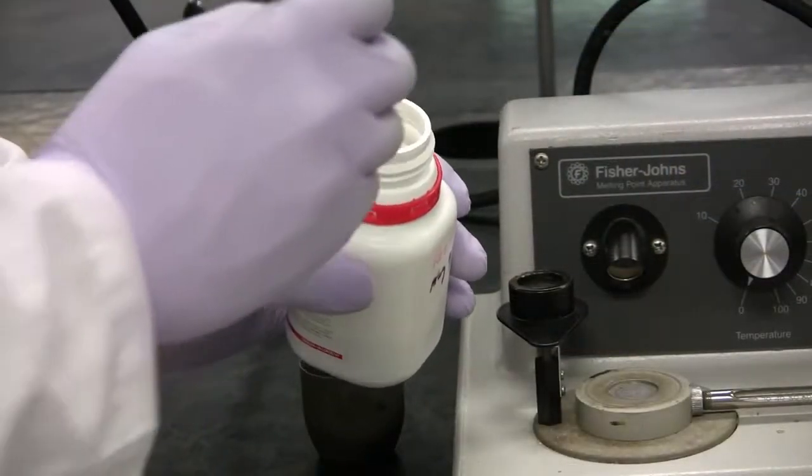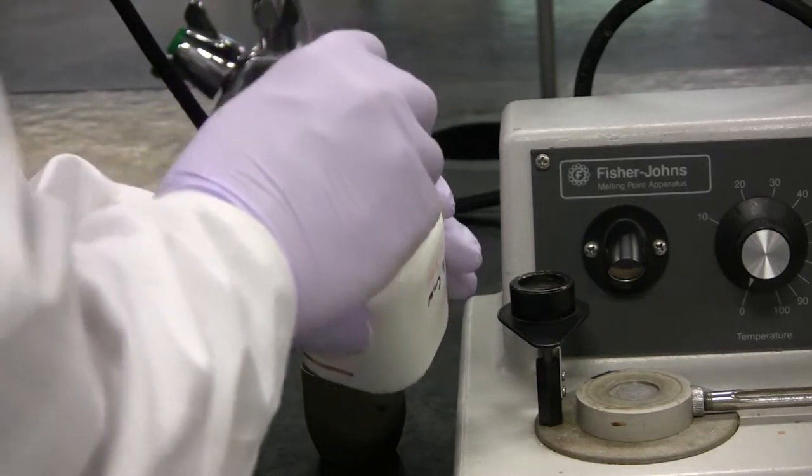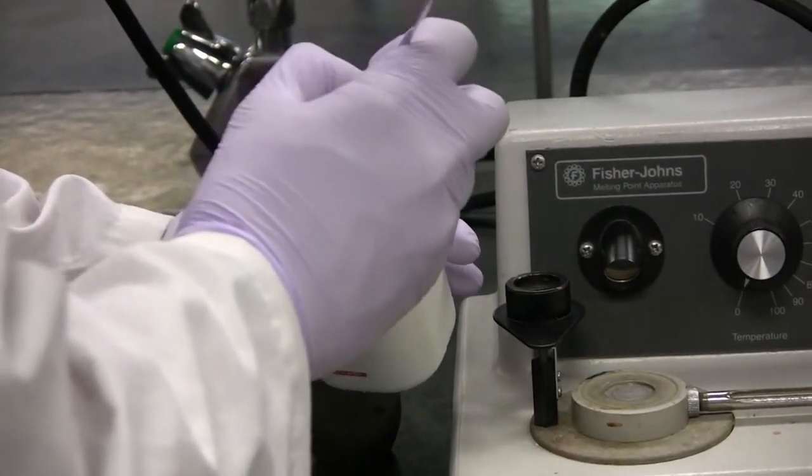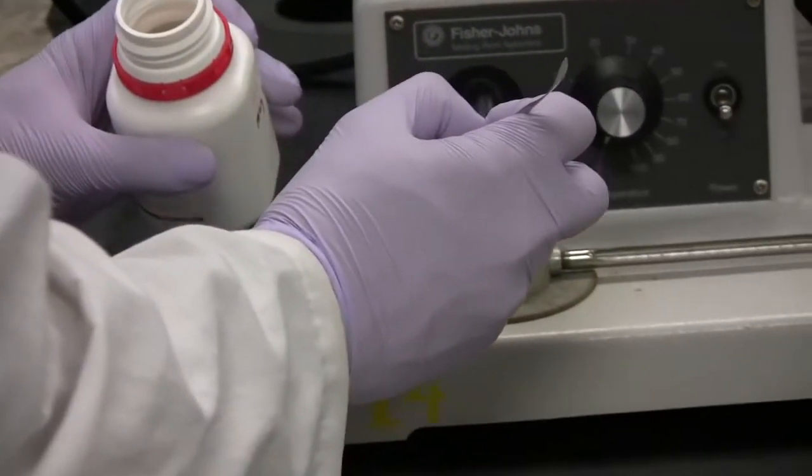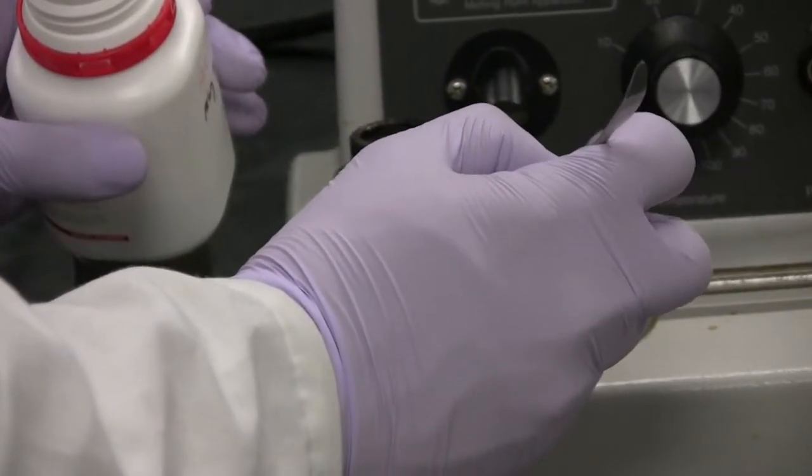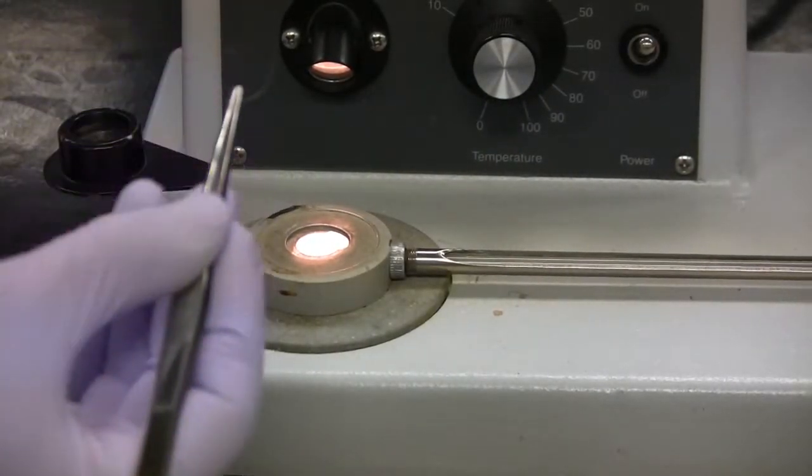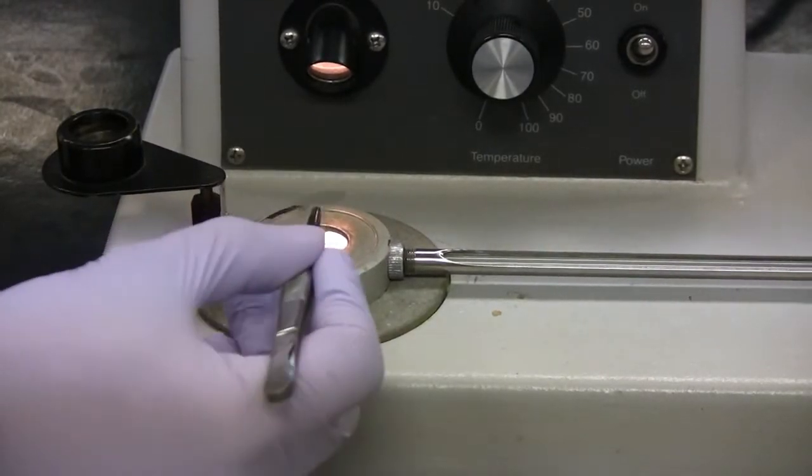Using the spatula, pull out the tiniest crystal you can possibly get and place this onto the cover slip. Now, place a cover slip on top of your crystal.